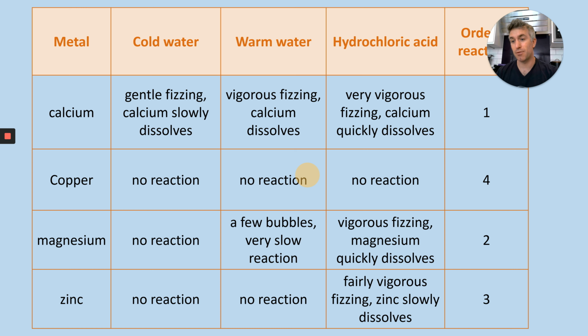If we were to add different metals in, you could probably work out the reaction for those. Say, for example, if we added in gold, what would you expect? Yes, you get no reaction from all of these. What about aluminium? Aluminium should be above zinc. So there we go. So you have all of this. Now it's time to answer some questions based upon this.